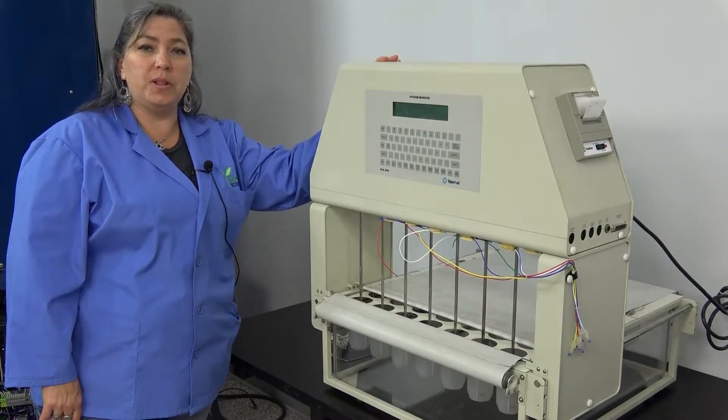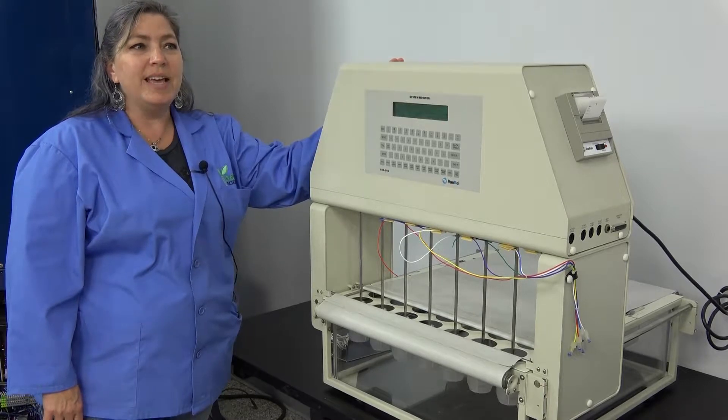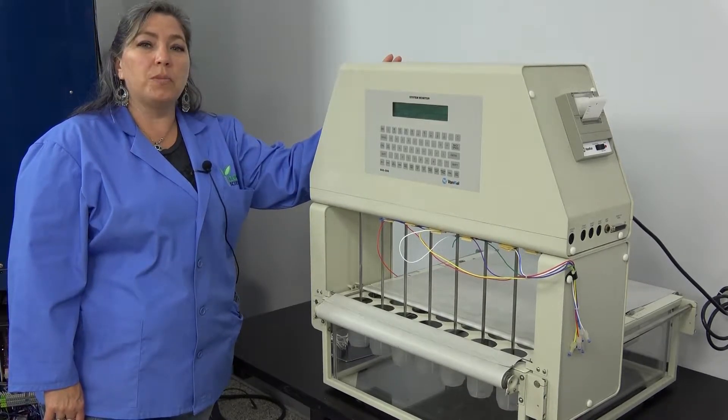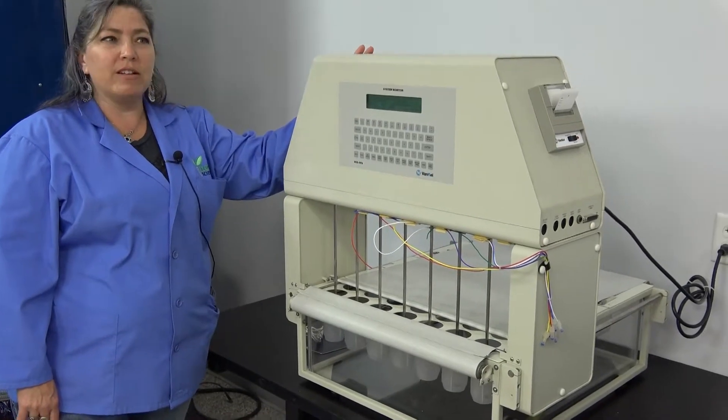Hi, I'm Lori and we're at New Life Scientific. Today we're talking about the BIO-DIS. This is a dip style dissolution testing system used in pharmaceutical and other testing applications. It is by Vankel.